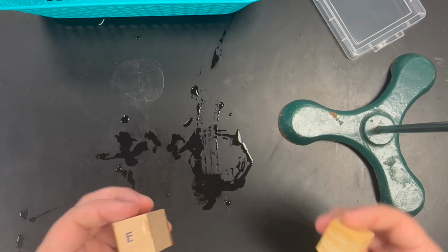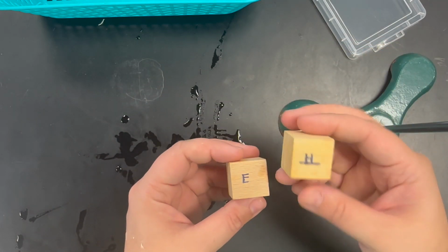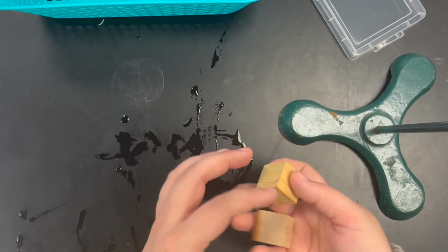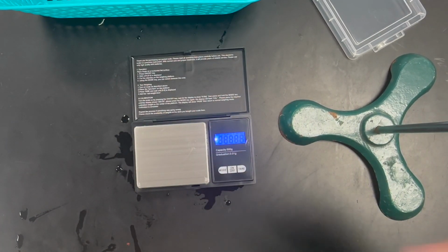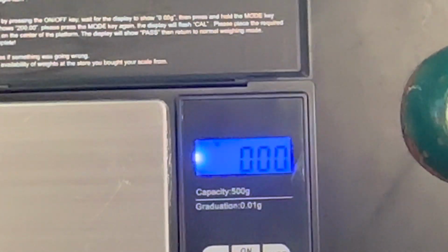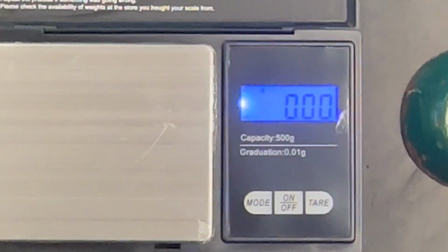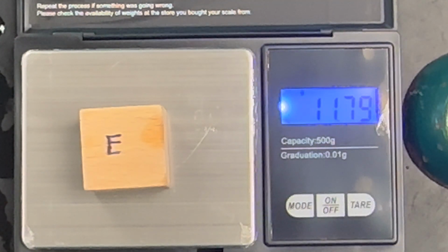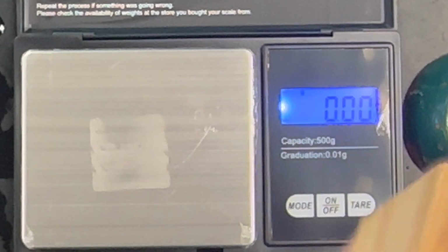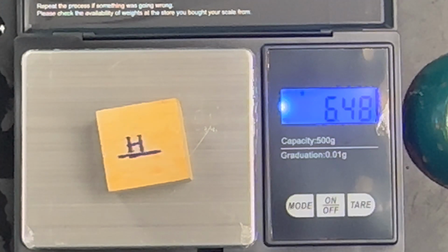Now, part 2 is looking at the 2 different pieces of wood. So we have H and we have E. Now for each of them, we're going to take the mass again. So right now it is zeroed. So the mass of E is 11.79 grams. So we're going to record that in the cube E section. The mass for cube H is 6.48 grams. We're going to record that in the cube H section.